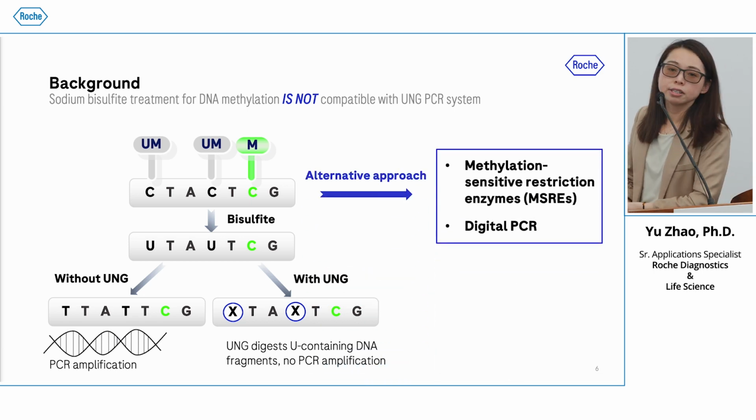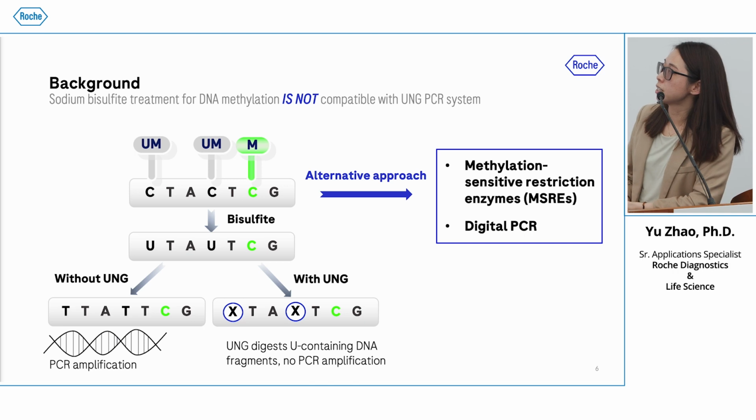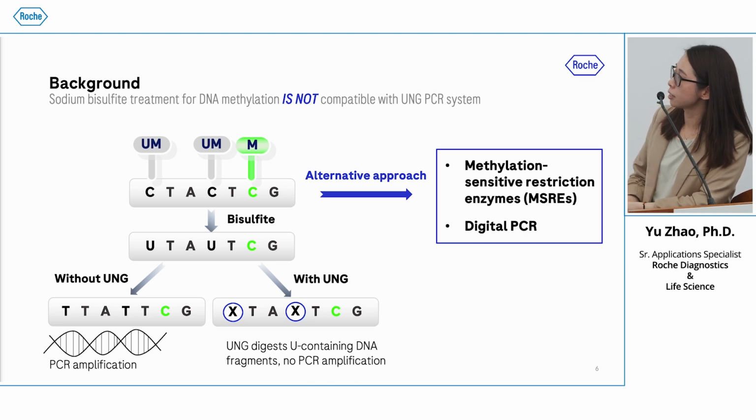So an alternative approach we propose here is to apply methylation-sensitive restriction enzyme treatment, followed by digital PCR detection. Let me introduce the concept of methylation-sensitive restriction enzymes and digital PCR.